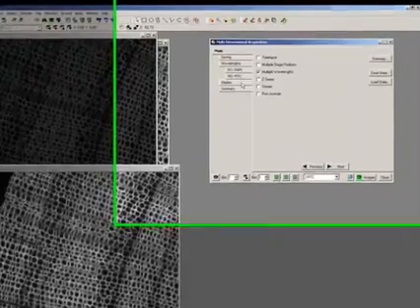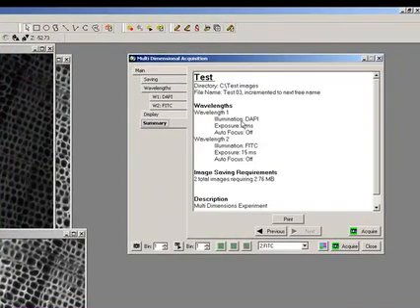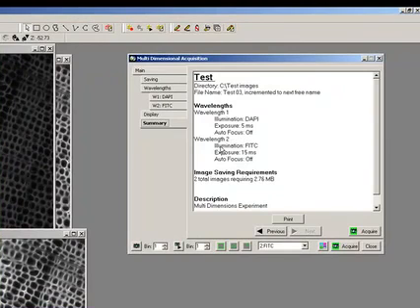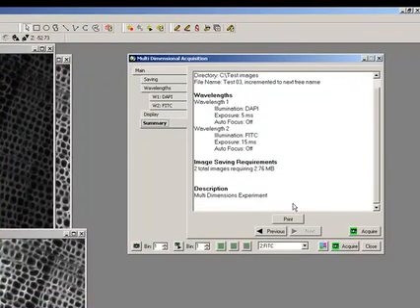You can have a look at the summary to see what you're going to do before you press that acquire button. You can see here we've got Wavelength 1, Illumination is DAPI, the exposure is five milliseconds, and the autofocus is off, and the same in Wavelength 2. It tells you how big it's going to be and the description of the type of experiment.